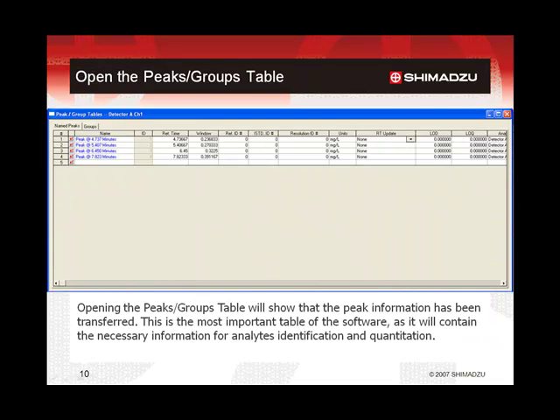Opening the peaks and groups table will show that the peak information has been transferred. The only name that the software can find is related to the peak retention time. The peaks and groups table is where the software can find the information for identification of the peaks, as well as all the information needed for performing calibration of the method. Therefore, this is the most important table in the software. It is recommended that any user interested in performing quantitation become very familiar with the functions of all the columns in this table. This presentation will only look at very basic settings for performing quantitation, so only a minimal set of columns will be examined.